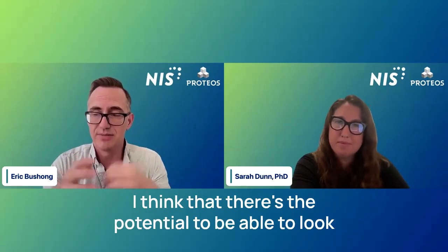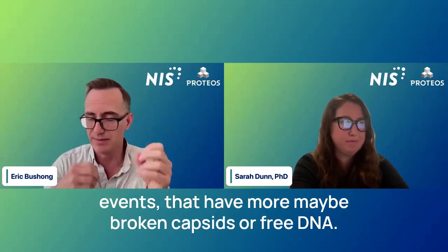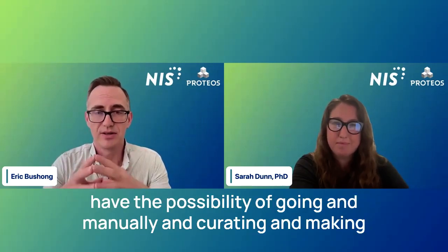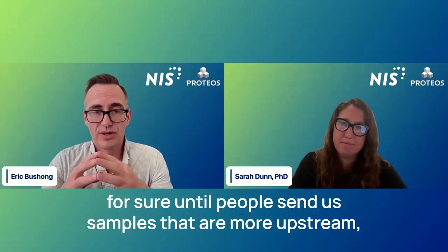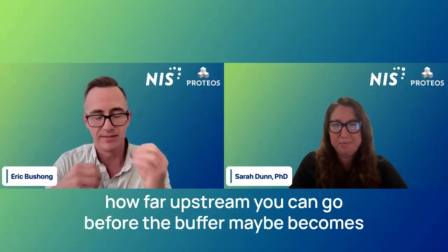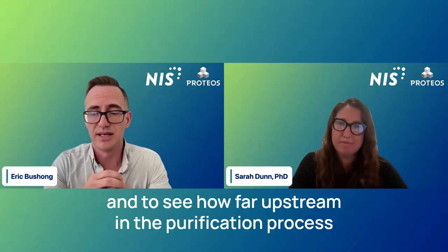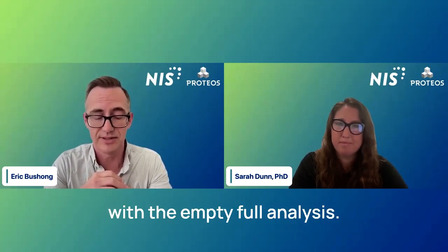I think that there's the potential to be able to look at more upstream samples that have more aggregation events, that have more maybe broken capsids or free DNA. I think this analysis would still work, especially because we do have the possibility of going in manually and curating and making sure that we have a good set of particles. Honestly, I don't know for sure until people send us samples that are more upstream, how far upstream you can go before the buffer maybe becomes too high salt concentration to affect the contrast. It's something that we'd be very interested in trying with clients and to see how far upstream in the purification process we can look at samples and still achieve accurate results with the empty full analysis.